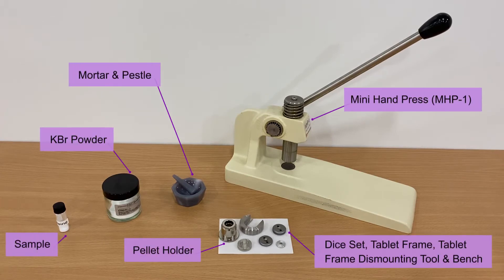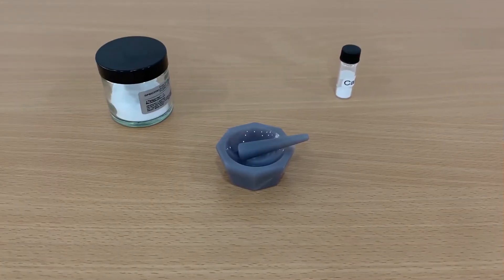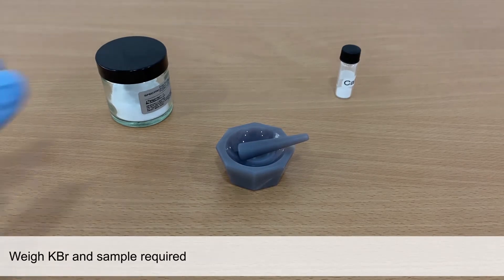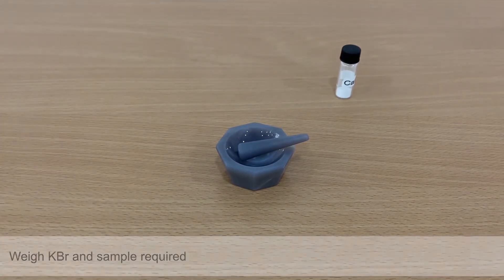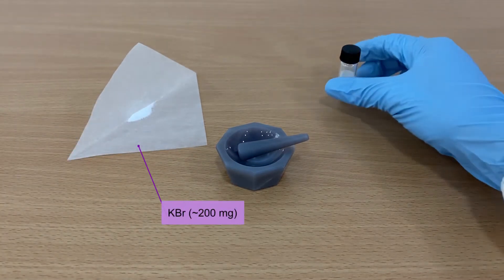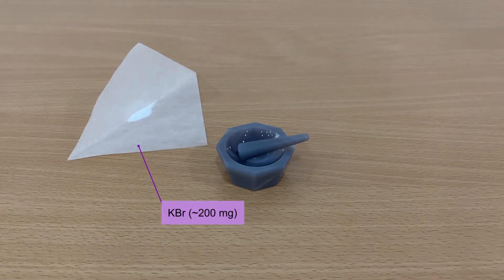Here are the items you are going to need. First, we are going to weigh the KBr powder and sample powder required. Approximately 1-2 mg of sample is mixed into 200 mg of KBr powder.